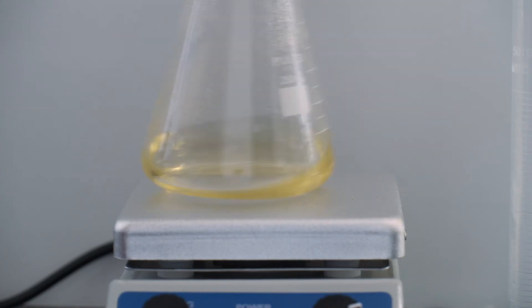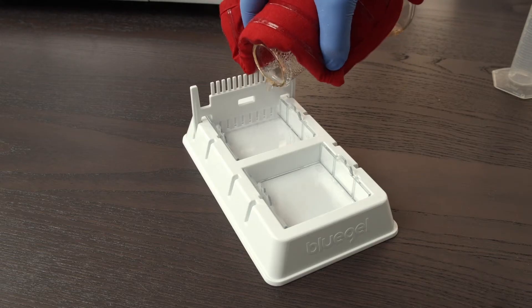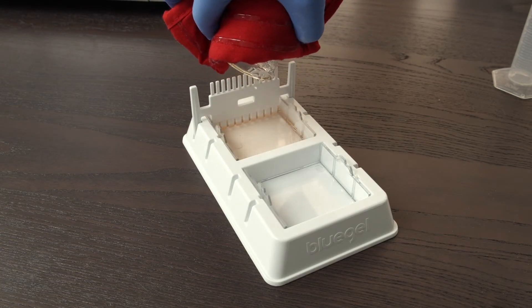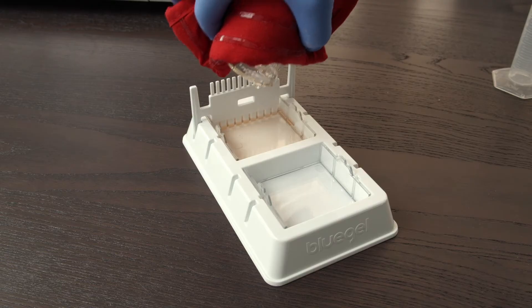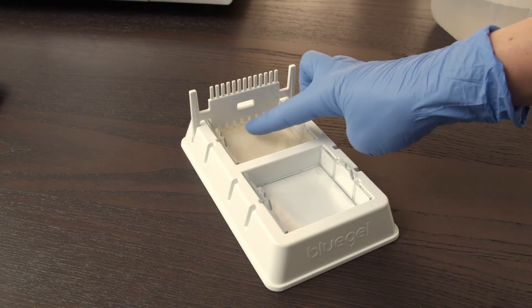You can also use a hot plate if a microwave is unavailable. Just make sure that the all-in-one tab is disintegrated before heating. Pour the gel into assembled gel casting trays. Make sure you've inserted the combs to create wells. The gel will set in about 10 minutes. Once cooled, it should feel firm like jello.